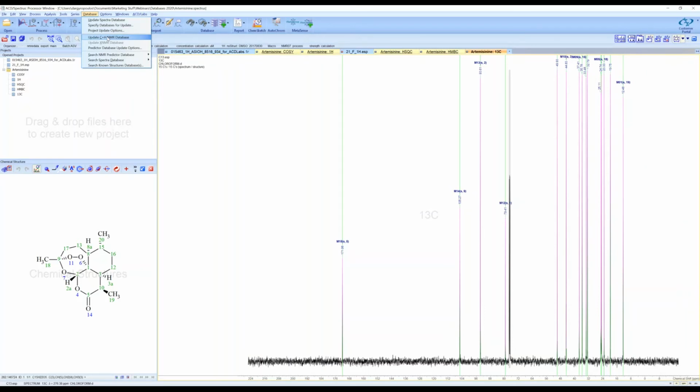We had a webinar a little while ago talking specifically about our predictors and how to use these things. Plus, we have many other resources showing how to do this. What I can say is that if you are working with novel chemistries, novel skeletons, it is highly recommended that you create your user training database, as this will improve the performance very significantly.